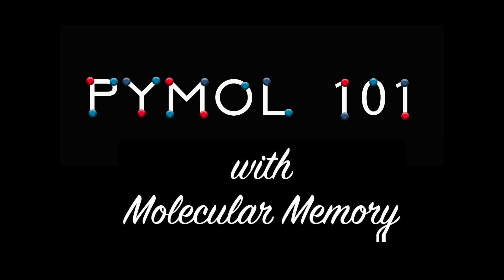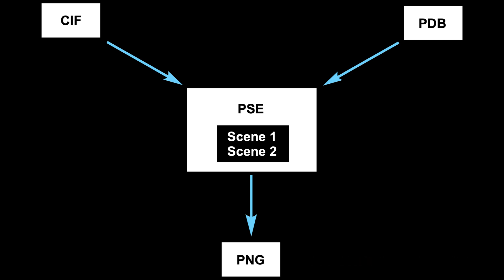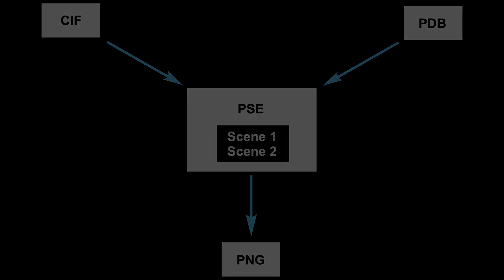Welcome to PyMOL 101 with Molecular Memory. In this lesson, we'll learn about the different PyMOL input and output file types and how to export a publication quality image. In the last part, we'll learn to work with scenes, one of the best ways to save work and time. Let's go.